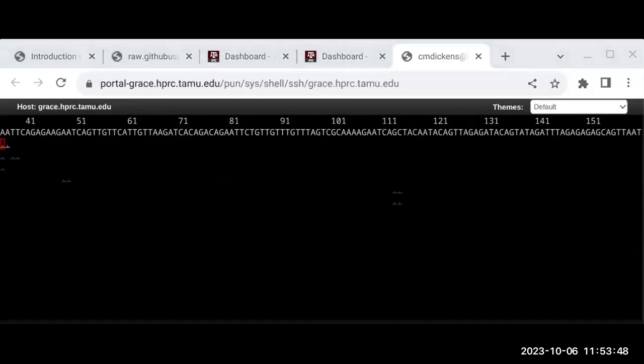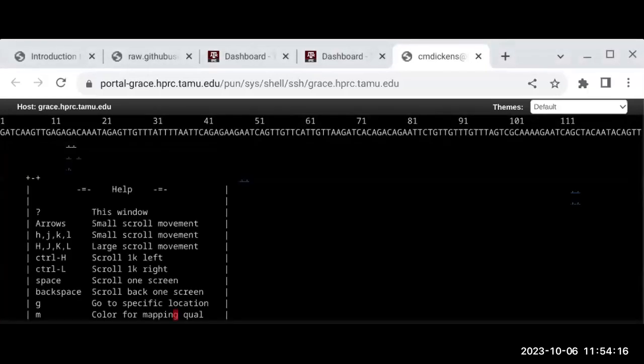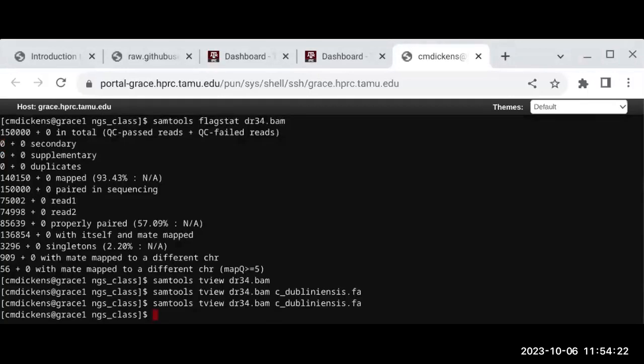And you've got the reference at the top. Wow, you can't really see that here either. Maybe you can see it better on that screen, but there are some blue underscores here with dots or commas. You can look at the help and see what the dots and commas mean. Okay, so Q to quit. The next one is, if you start this and hit question mark, it'll give you a help menu. It tells you some things. Some of this is not on the help menu, so go to the website and see what this other stuff is about, the commas and dots.